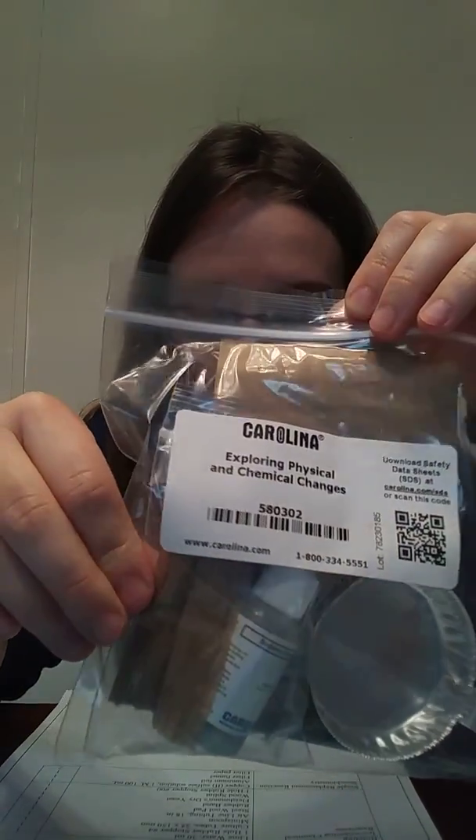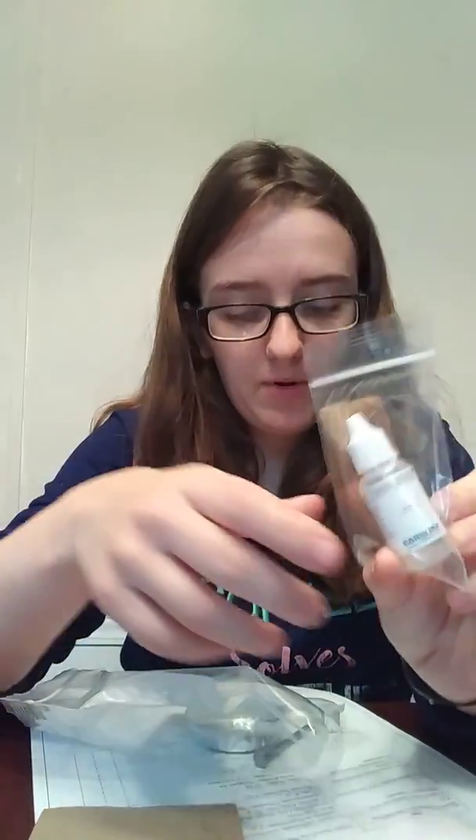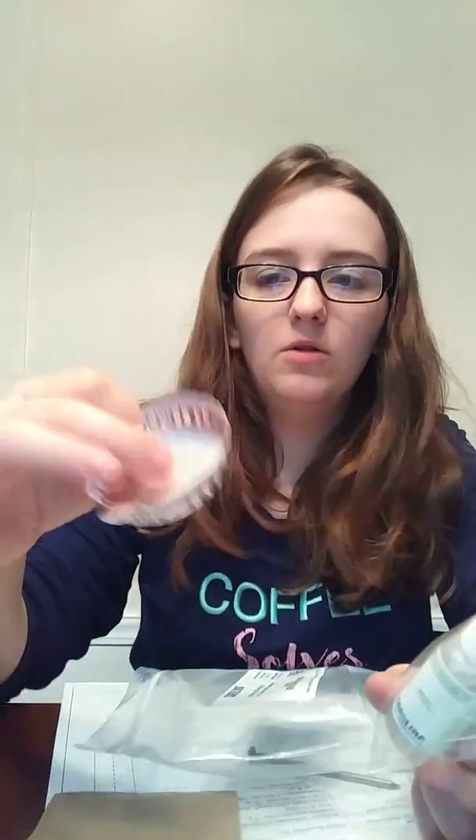Exploring physical and chemical changes — this one has sodium carbonate solution, sodium polyacrylate, iron, and an aluminum weigh dish. It comes in a paper envelope. We have the chemical, a nail, and the little aluminum dish. So be careful — this is really, really thin, so just be careful when you're moving it around that you're not crushing it.